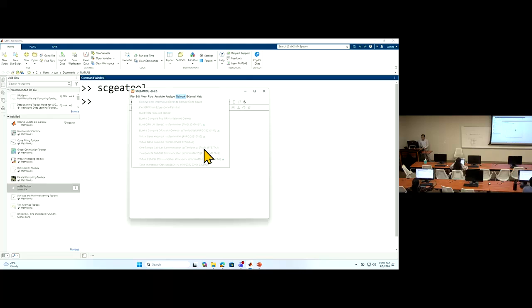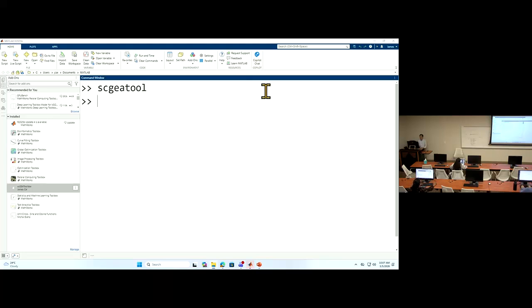It's not fully implemented, but there are two options that make your analysis much faster. So if you don't need very accurate results, maybe just run this very quickly. I'll show you later by the end of the second half of the lecture. Okay, so we have this upgraded.